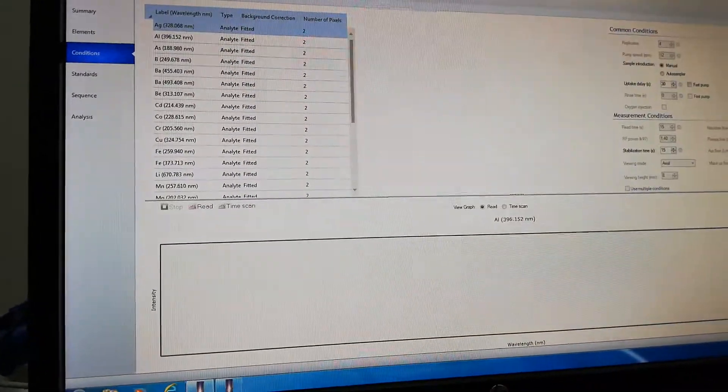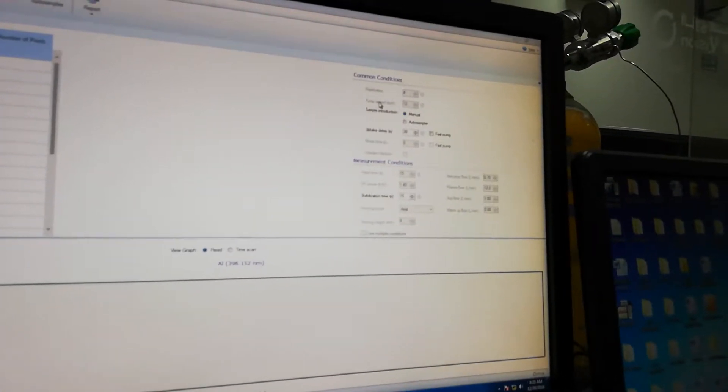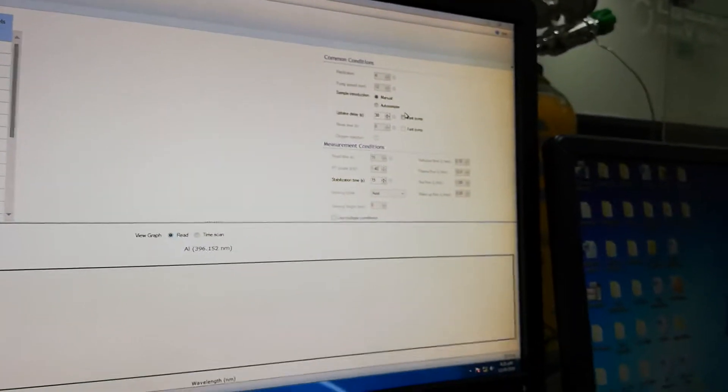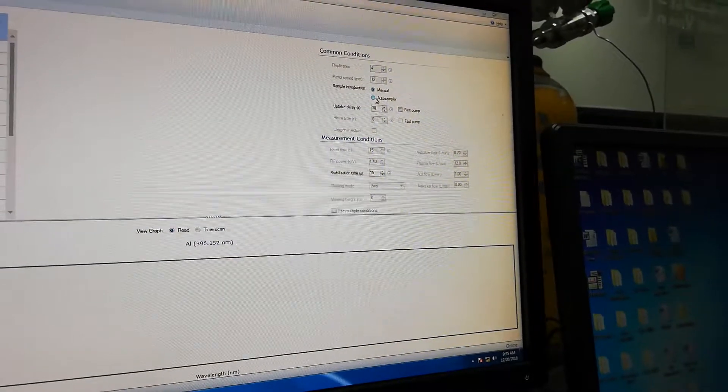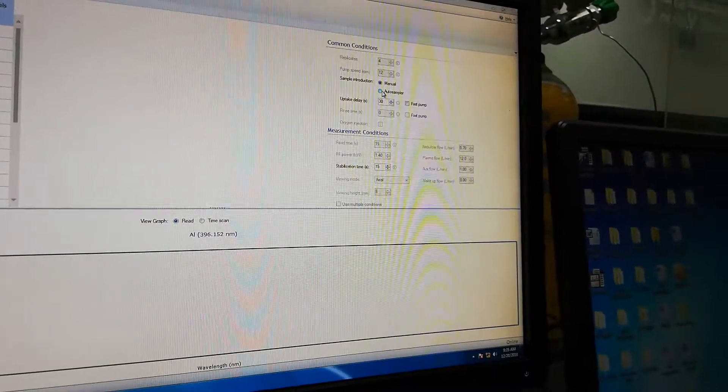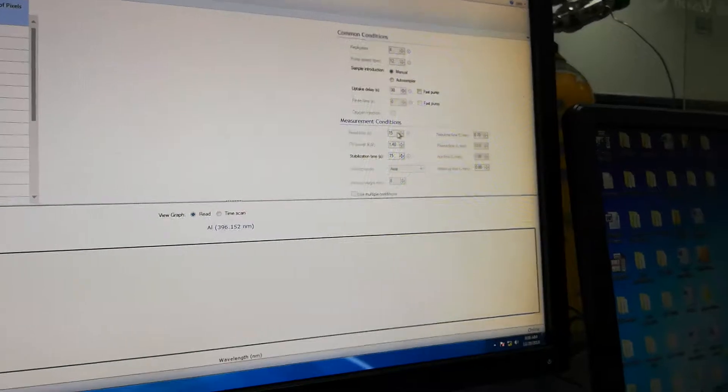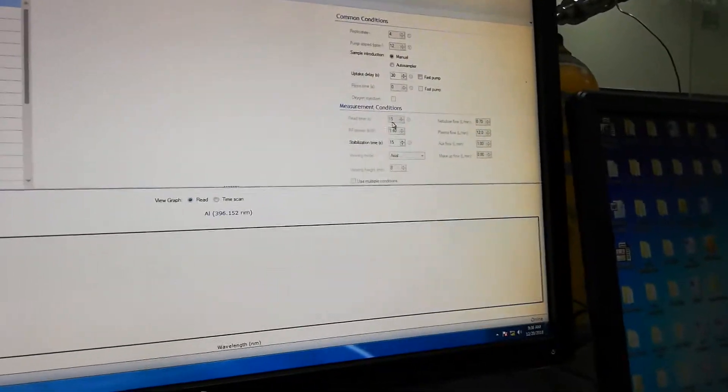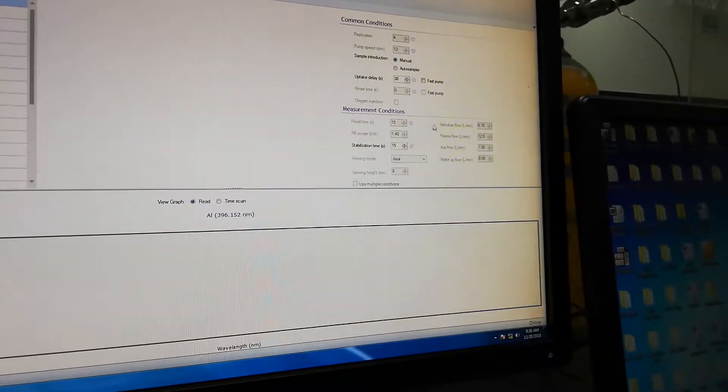Then conditions—this is really important. Here you set the conditions: replicate, pump speed, sample introduction (manual or auto sampler). Currently all aqueous samples run manually; the auto sampler is only for organic samples.